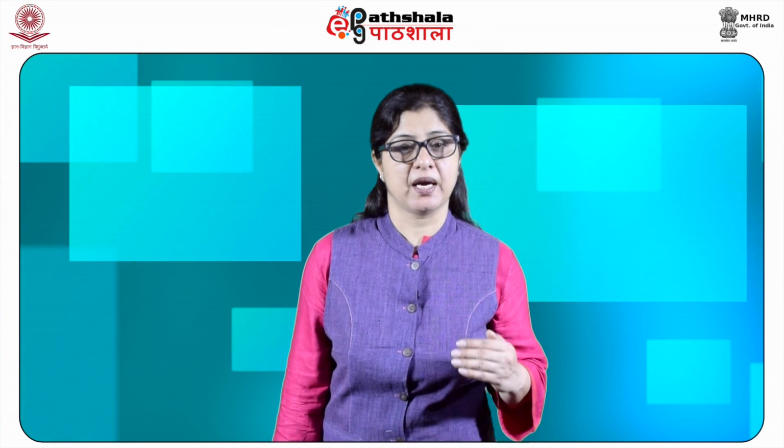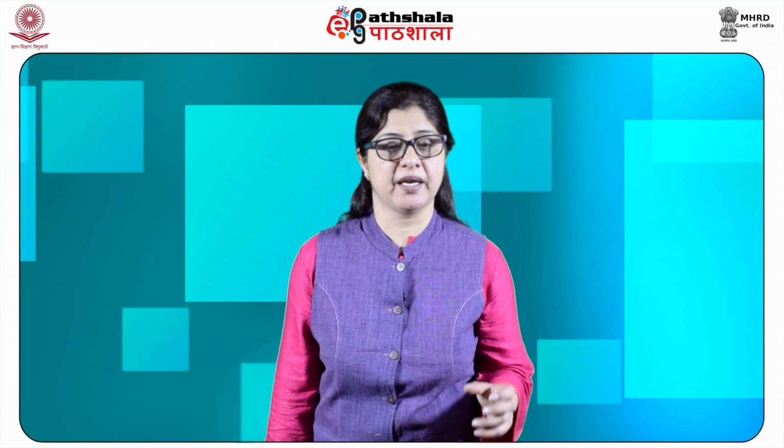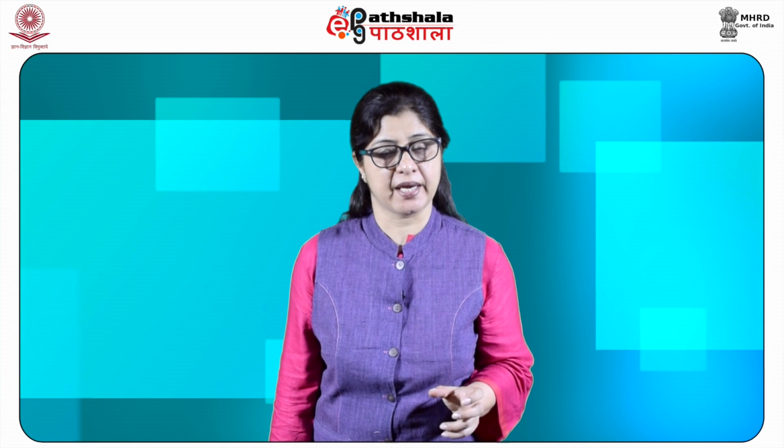Ion exchange separations are mainly carried out in columns packed with an ion exchanger. There are two types of ion exchangers, namely cation and anion exchangers. The principle of ion exchange chromatography is based upon the simple fact that different cations or anions have different capacity to undergo exchange reactions on the surface of a given exchanger.